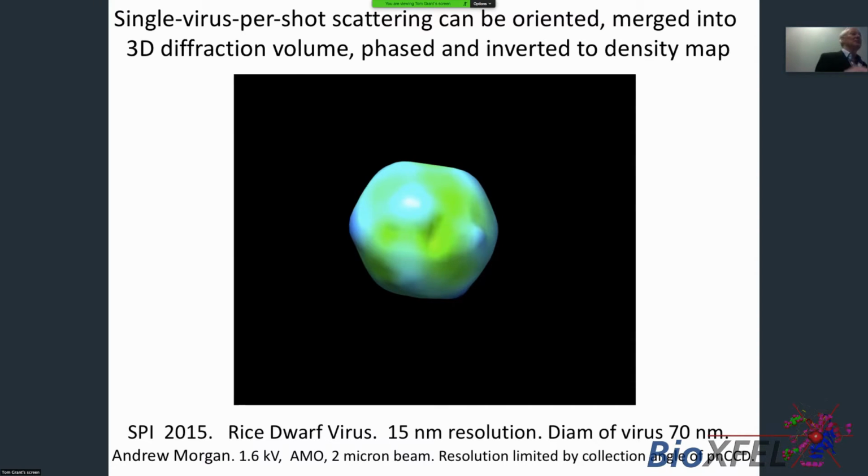So you have this problem, the same problem arises in cryo-EM. Our problem is different. We have Friedel symmetry in our diffraction patterns. They don't have Friedel symmetry in their real space images that they work with. And we have a phase problem, which they don't have, because imaging solves the phase problem. So it's more difficult, but there are methods to solve those problems.